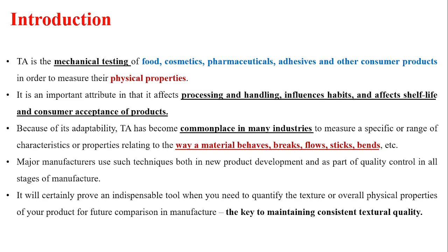It is a very important instrument for measuring the physical properties of these products. It is an important attribute for processing and handling of the product. Texture also affects the shelf life and consumer acceptance of the products.